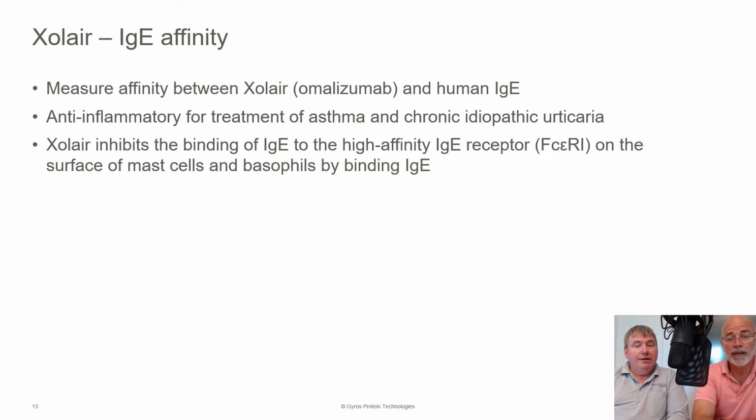Yep, and it speaks to the question of it isn't always the highest affinity drug that's the most therapeutically useful. So sometimes a slightly lower affinity has a better biological efficacy profile, and this is certainly the case for Xolair. Exactly.